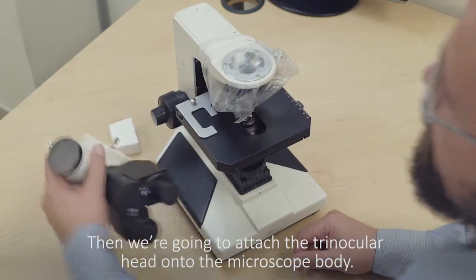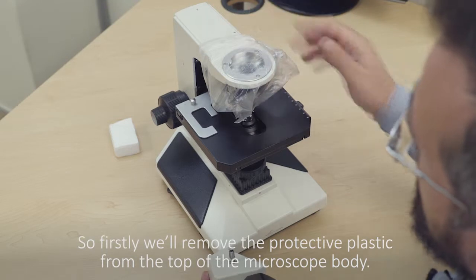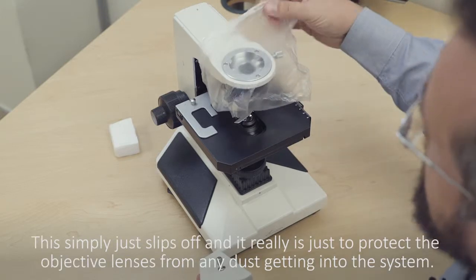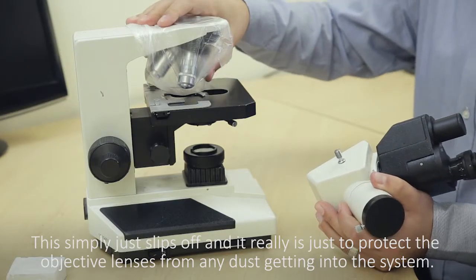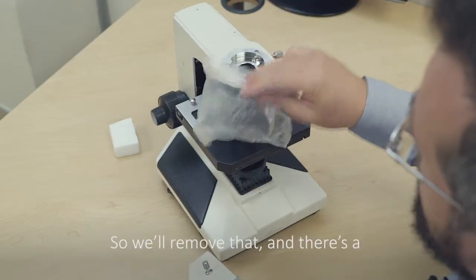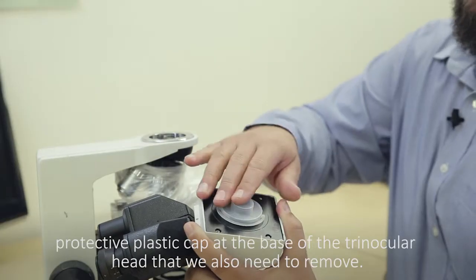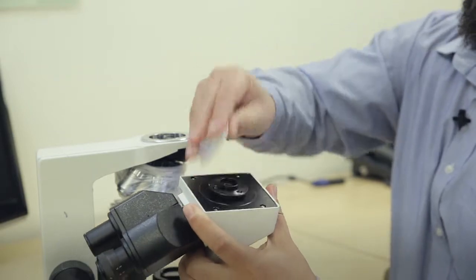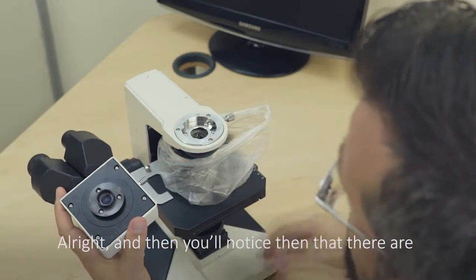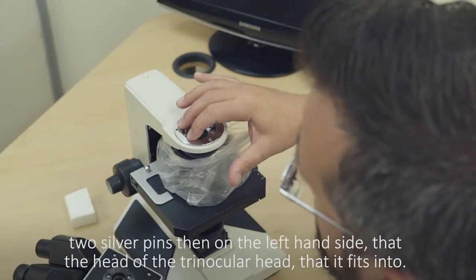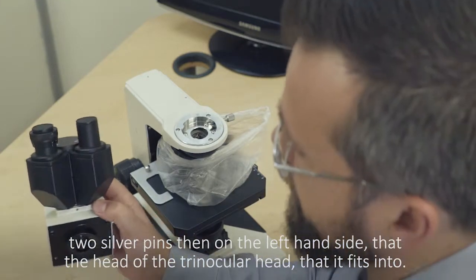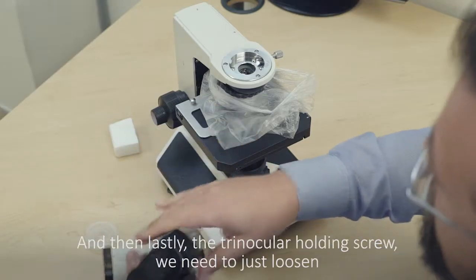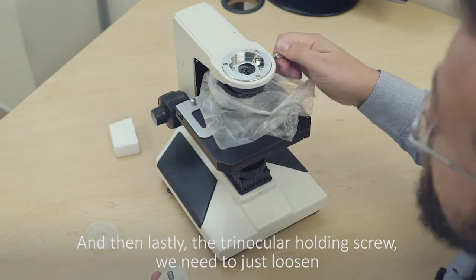Then we're going to attach the trinocular head onto the microscope body. So firstly we'll remove the protective plastic from the top of the microscope body. This simply just slips off and it really is just to protect the objective lenses from any dust getting into the system. We'll remove that and there's a protective plastic cap on the base of the trinocular head that we also need to remove. You'll notice that there are two silver pins then on the left hand side that the head of the trinocular head fits into, that basically hold onto this area here. And then lastly the trinocular holding screw we need to just loosen.